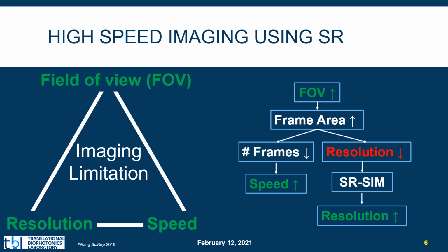The objective of this study was to determine whether SIM could be used for both optical sectioning and resolution enhancement in turbid samples using a very low NA objective lens with wide field of view, which is different from standard approaches which use SIM with very high NA objectives with the goal to beat the diffraction limit.